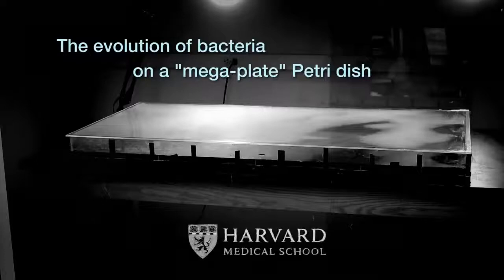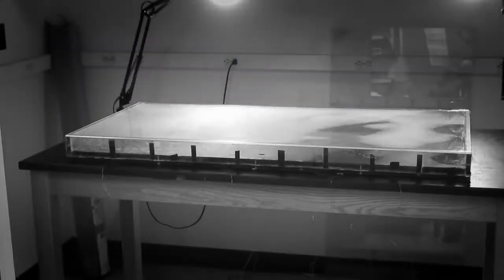What we ended up building was basically a petri dish, except that it's 2 feet by 4 feet. And the way we set it up is that there are 9 bands, and at the base of each of these bands, we put a normal petri dish thick agar with different amounts of antibiotic. On the outside, there's no antibiotic.